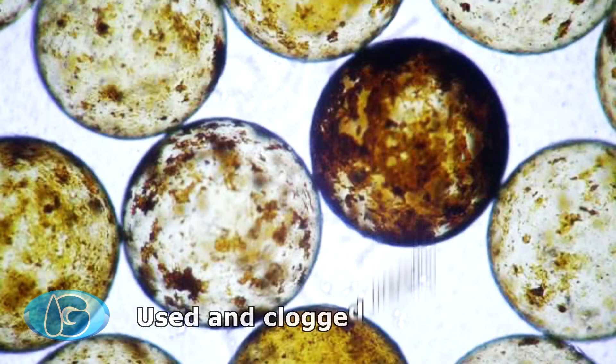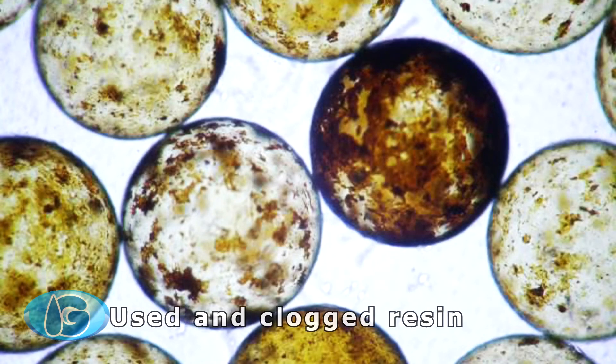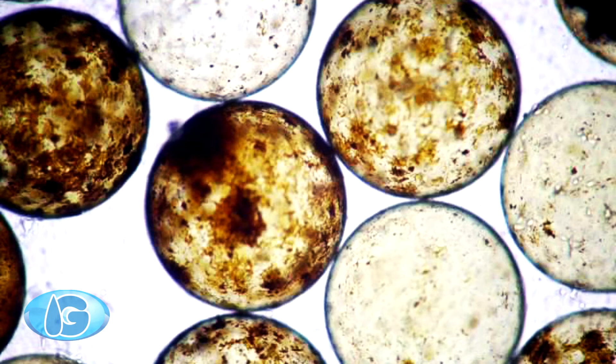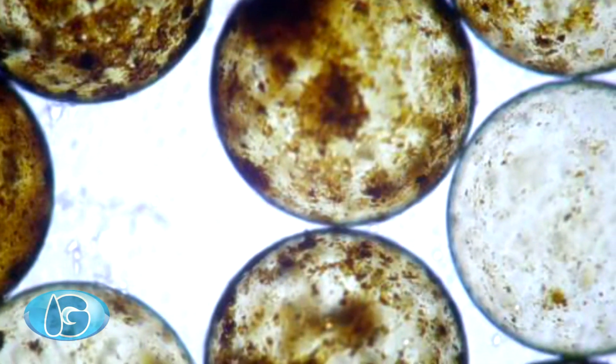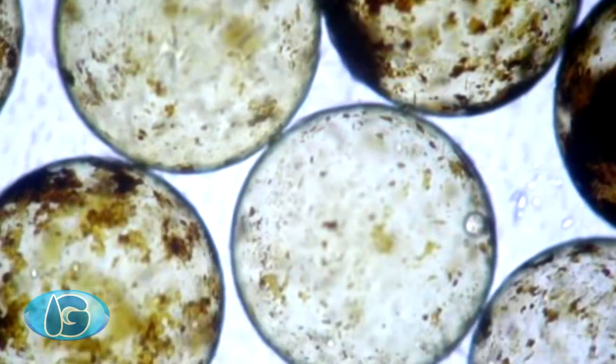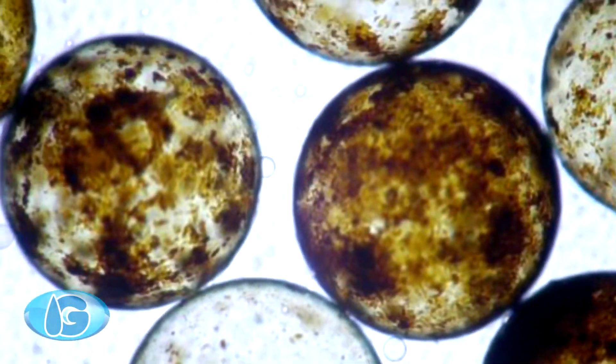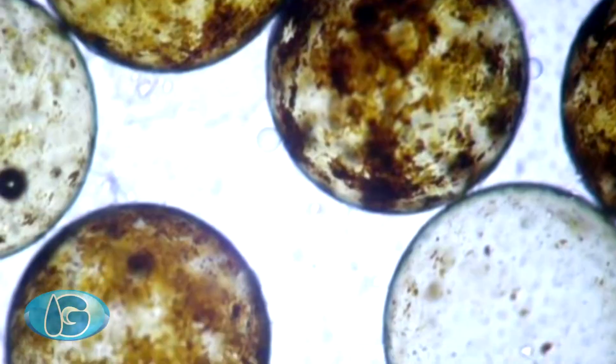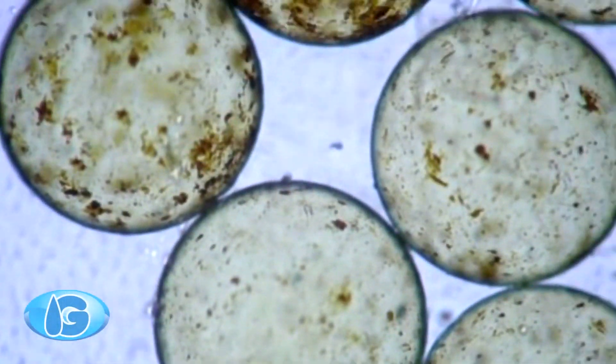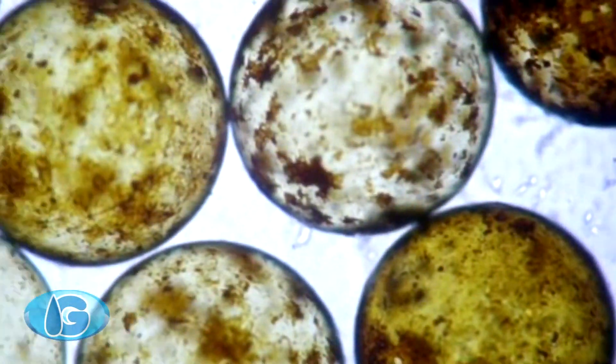We change our study to watch used resins. You can see in the video a clogged resin. Some spheres are very dark, you can see fouling. This resin is probably in the point of being replaced, or even you can try a cleaning using muriatic acid. But it depends on what's taking place, the grade of contamination.